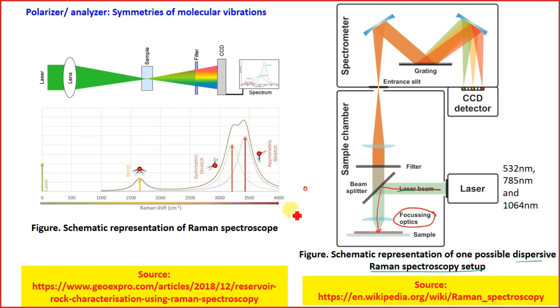And one of the important things is that the laser has a small diameter. So most of the energy is concentrated in a small area. And also the dispersion of the photons from the laser beam is less as compared to normal LEDs, because from LEDs the light is emitted in all directions. However, in laser beams you have a directed photon migration. So it falls onto the sample, and during this time some of the radiation will be lost in the straight path.